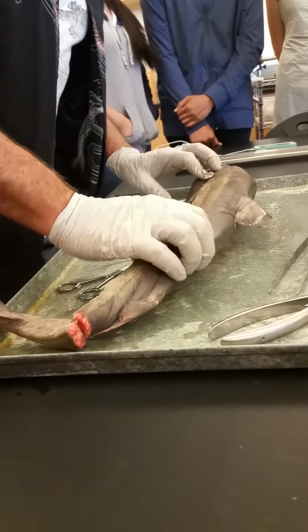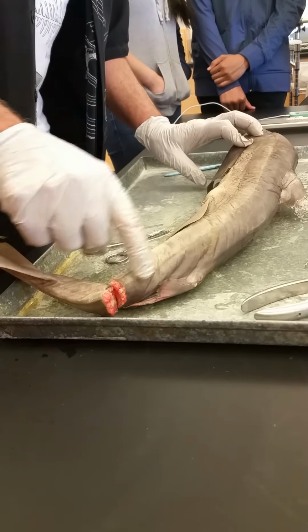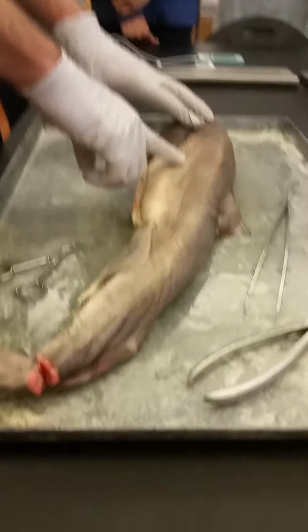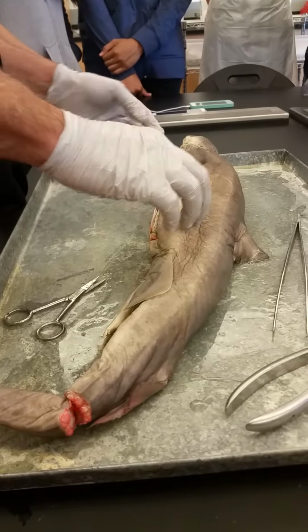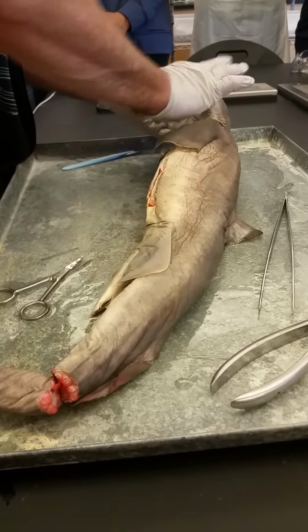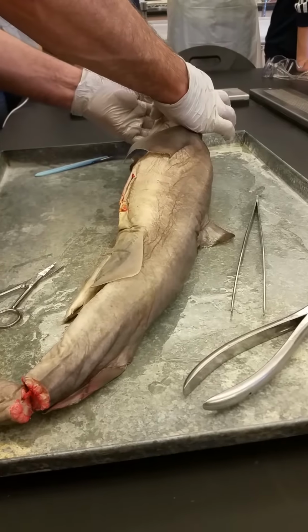In terms of sensory systems, they do have a lateral line system, like we saw in the bony fish. So a series of pores with those vibration sensors in them, so they can feel anything coming at them. They can feel themselves around. And this particular fish does school, so they swim in schools, and know where the other members of the school are. But interesting, in the sharks, in addition to running down the side of their body, it also runs across their face. So there's branches of it around their eyes, branches of it around their mouth.